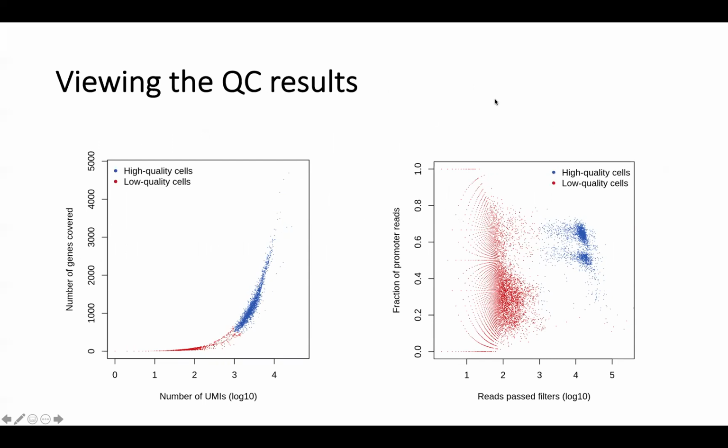Does anybody know which one's which? Quick question. Which one is single cell RNA-seq, left or right? One on the left? Yeah, yep, because of genes.